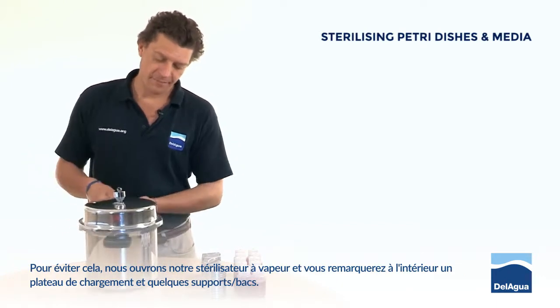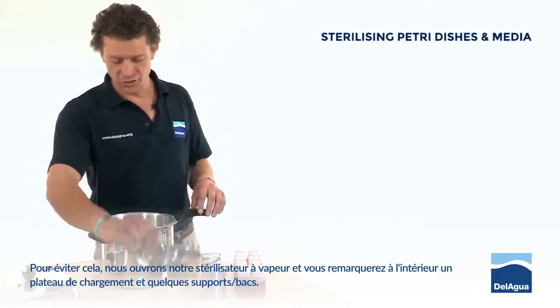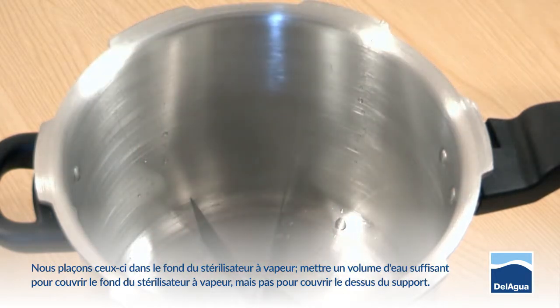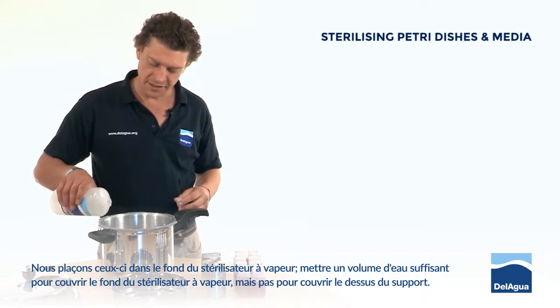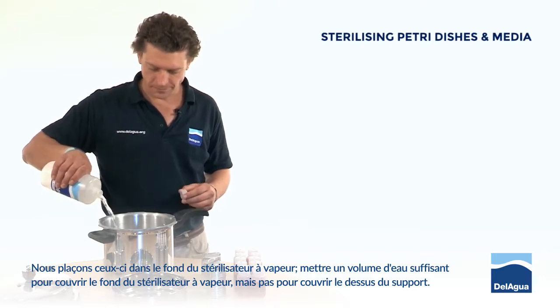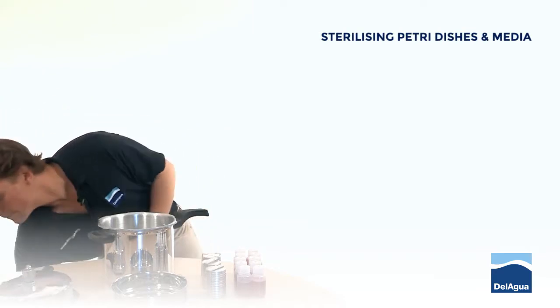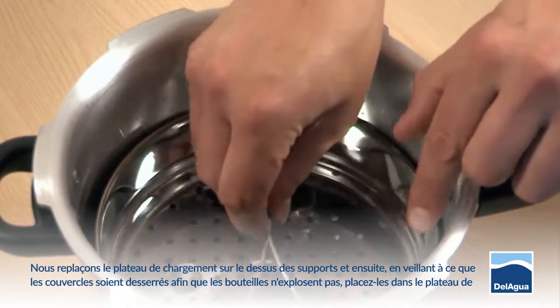In order to prevent that, we open our steam steriliser. You notice inside there's a load tray and there are a couple of cradles, supports. We place those in the bottom of the steam steriliser, put sufficient volume of water to cover the bottom of the steam steriliser, but not to cover the top of the support. We replace the load tray on top of the supports.